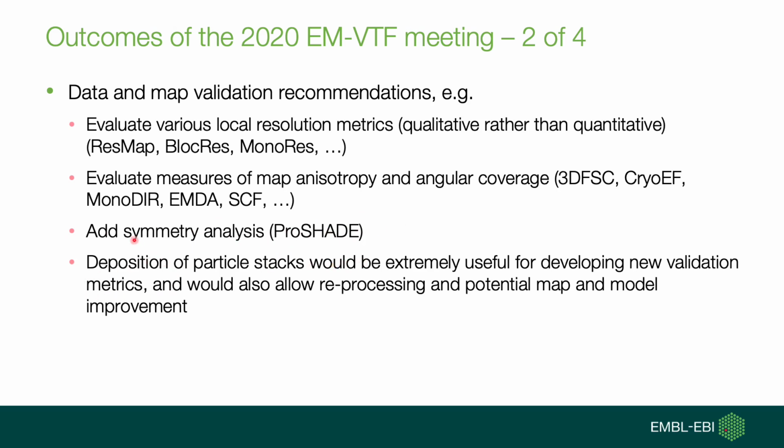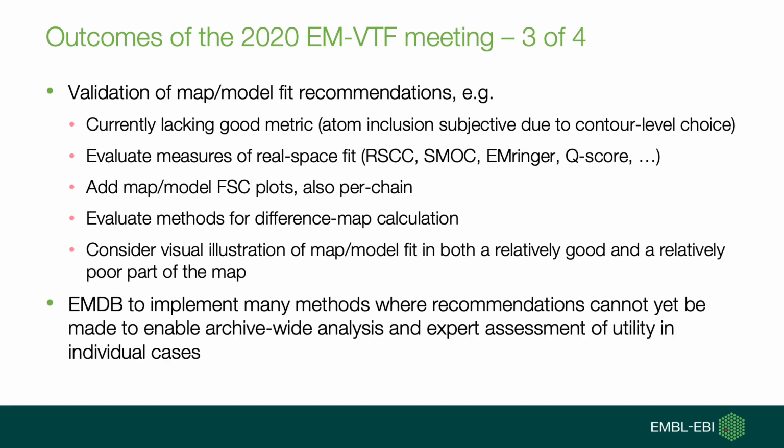It was also noted that deposition of particle stacks would be extremely helpful for validation and also for reprocessing and maybe re-refinement. In terms of the validation of map and model fits, it was noted that there was no good metric in the current validation reports, because we have atom inclusion there, but that's very subjective, because if you change the contour level, of course the number of atoms that are included inside the map increases as well.